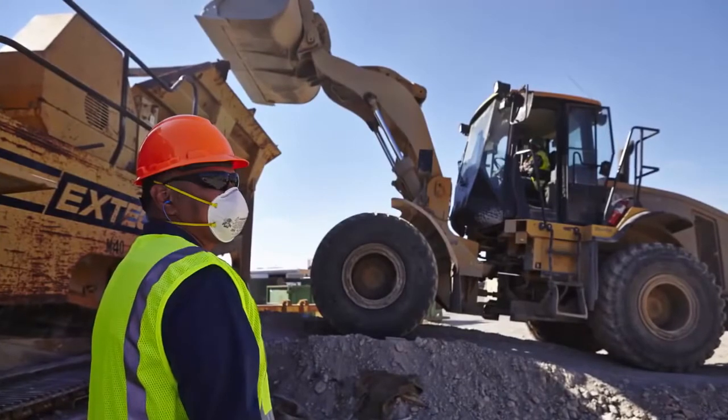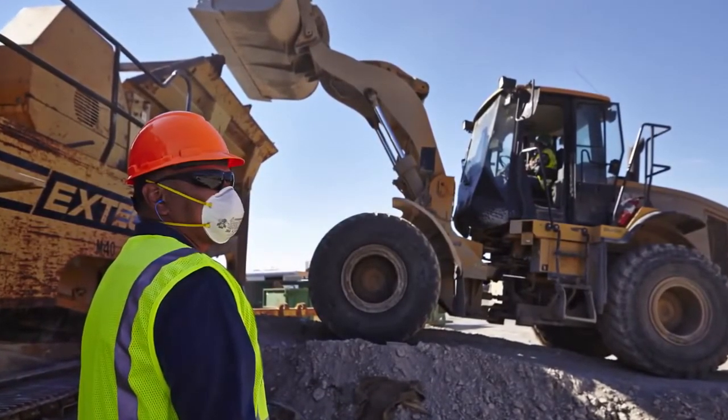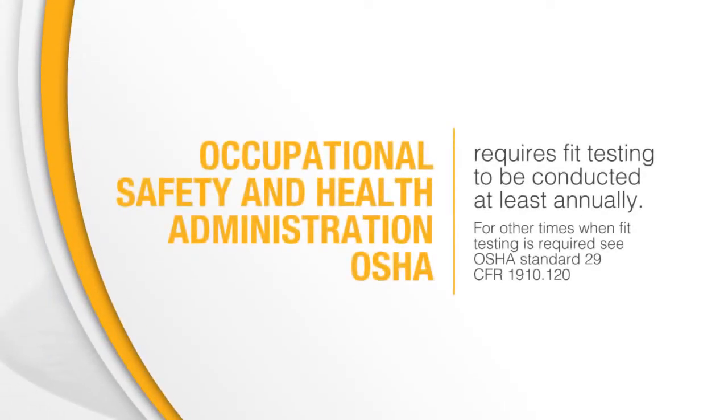When you are first issued a respirator and have learned to put it on correctly, you must make sure your respirator fits properly. As part of a complete respiratory protection program, the Occupational Safety and Health Administration, OSHA, requires fit testing to be conducted at least annually.